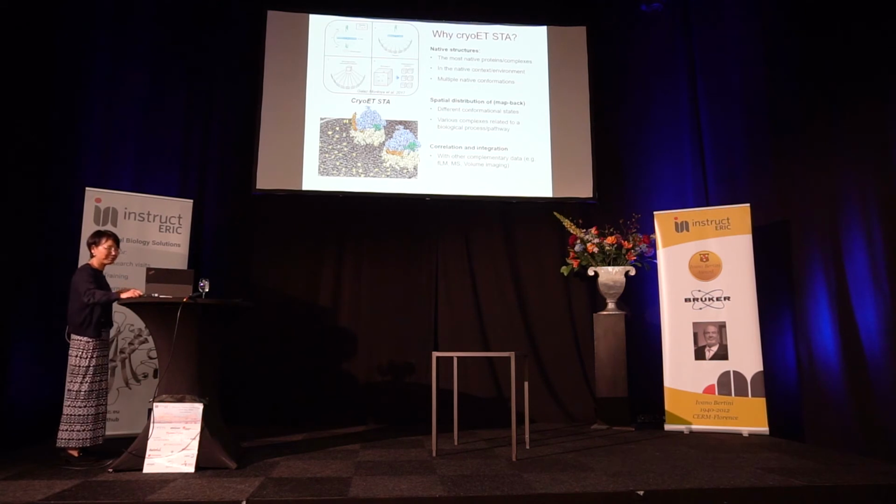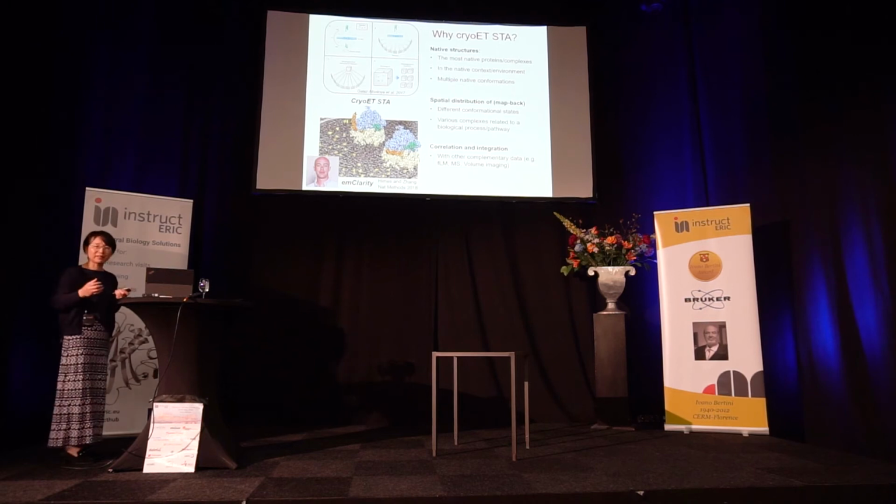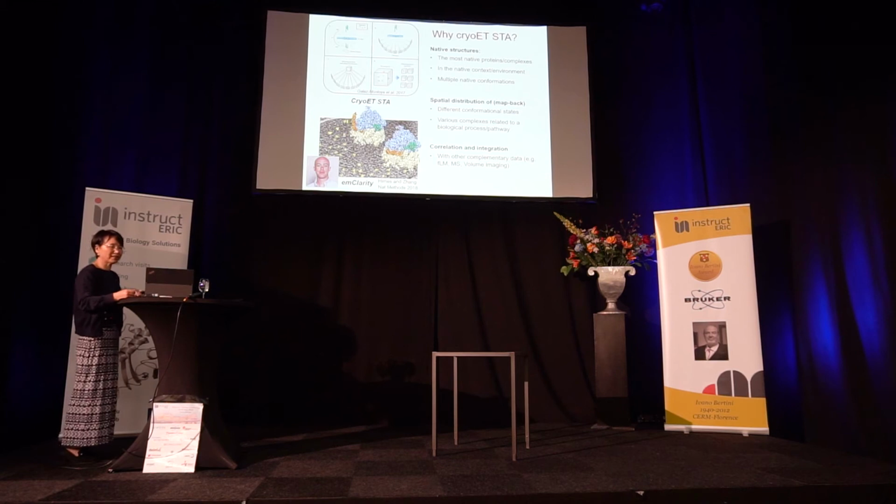In order to achieve high resolution for cryo-ET subtomogram averaging, a few years ago my graduate student Bernhard developed a software called EMClarity, which allows us to achieve high resolution for subtomogram averaging. This software, along with RELION, which you heard about yesterday, and a number of other packages like Warp/M and Python AV3, all allow structural analysis in situ at high resolution.